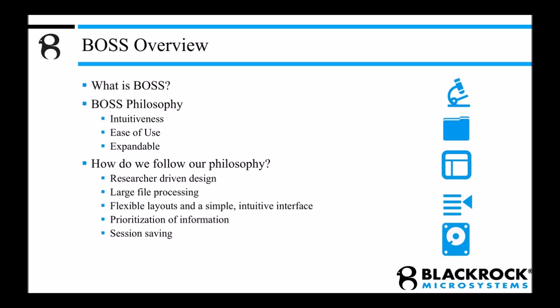use software package. The idea is that the user will be able to open the software, load a file, and without having to read a lengthy manual, they can just go through processing the data and easily sort their spikes. Spike sorting, as you may agree, should not take as much time as it currently does. The process has to be very intuitive, so you can spend more time on designing the experiment and also analyzing the collected data.